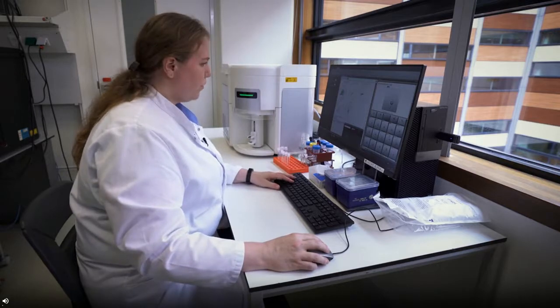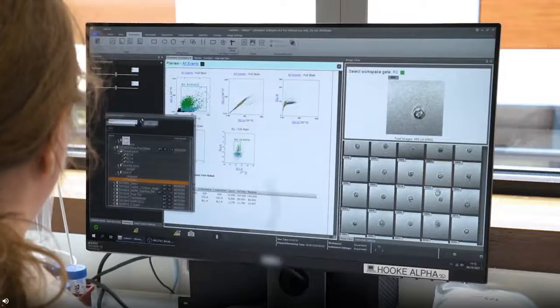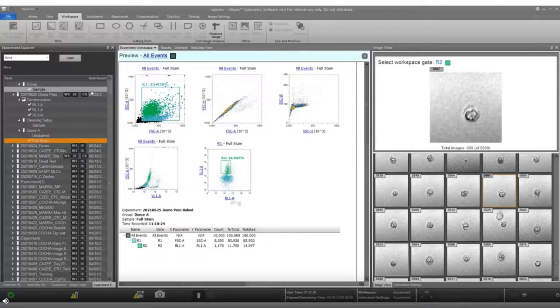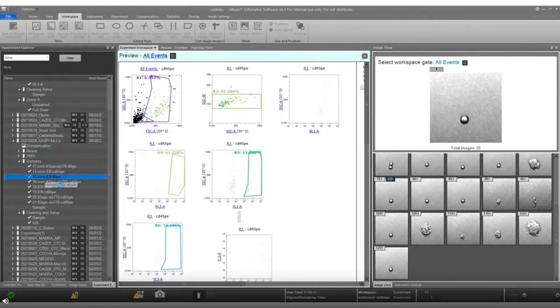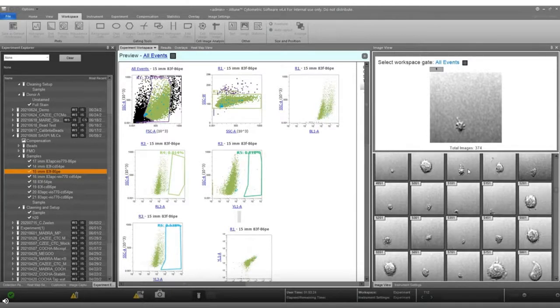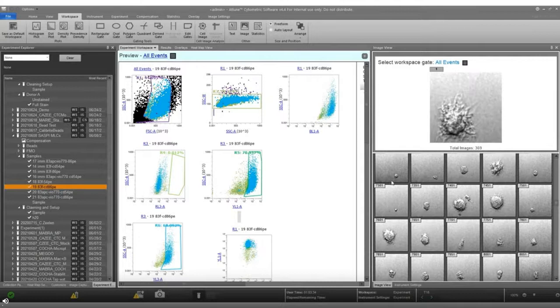And at this point, I wanted to show off some other experiments that we've been able to run here. I will just bring this window over here and tether it to this section of our screen. This one is pretty cool. We're looking at immature and mature dendritic cells. So this is another user. I wasn't actively here when these were being acquired, but the images, as you can see, are quite nice. So these are our immature DCs. And then I can come over to select the same sample with the same staining, our mature DCs.